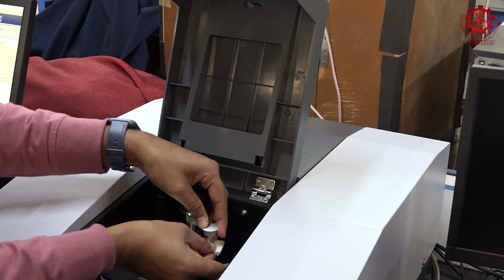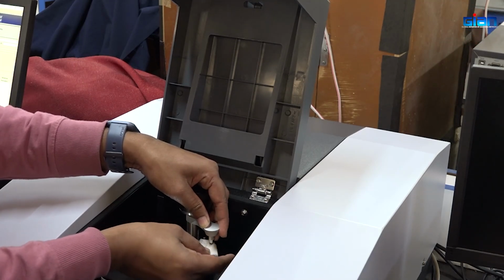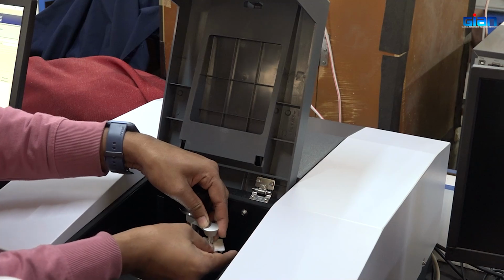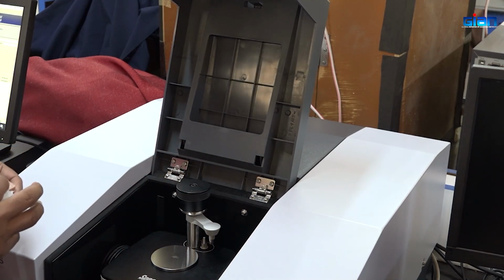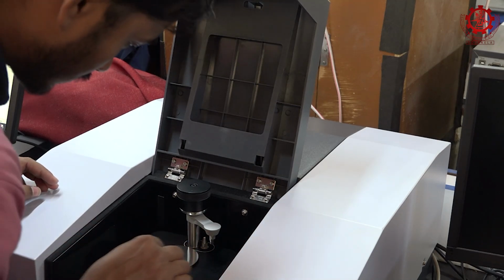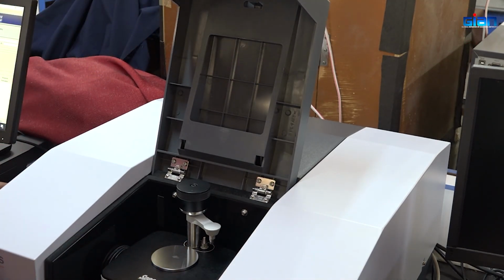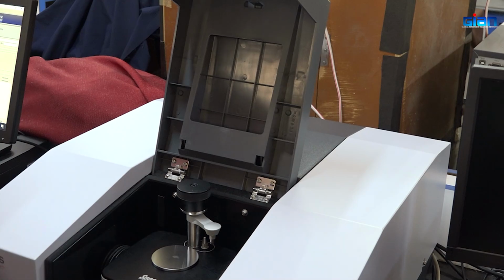Of course, OH bond, carbon oxygen bond, carbon carbon bond, carbon hydrogen bond. So, these peaks are for all those bonds. Please remember, it has nothing to do with the molecular weight. It is how many bonds are present in the molecule. Big molecule, so many bonds. So, not necessarily if molecular weight is high, it will not come, it will come here.